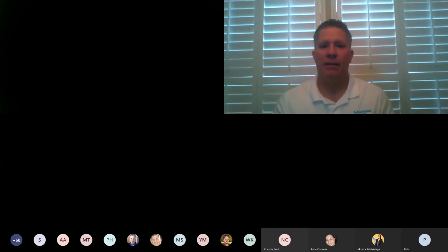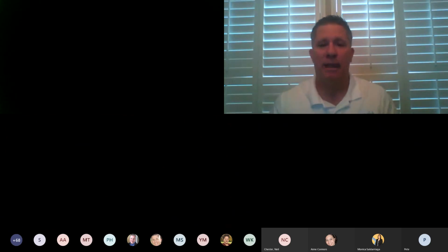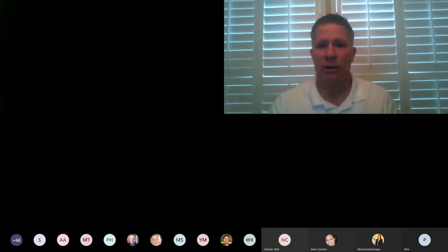And that's the nice thing about having the MAS family. You have all of your samplers calibrated by one device, and it's only that big. And this gets calibrated by us once a year off of an NIST standard. So your MAS is one link away from the NIST standard, which is really important in the world of calibrations.